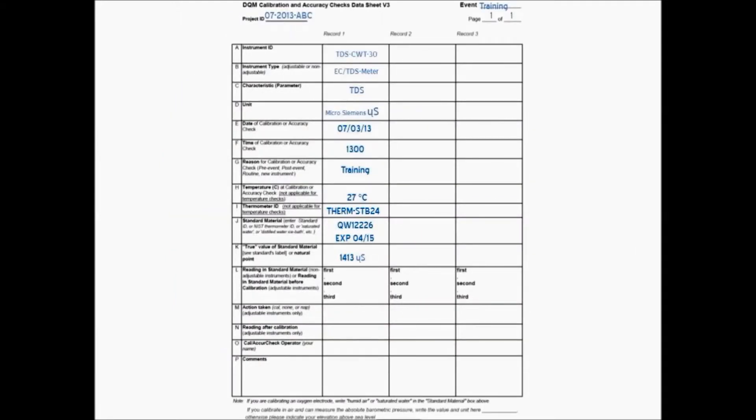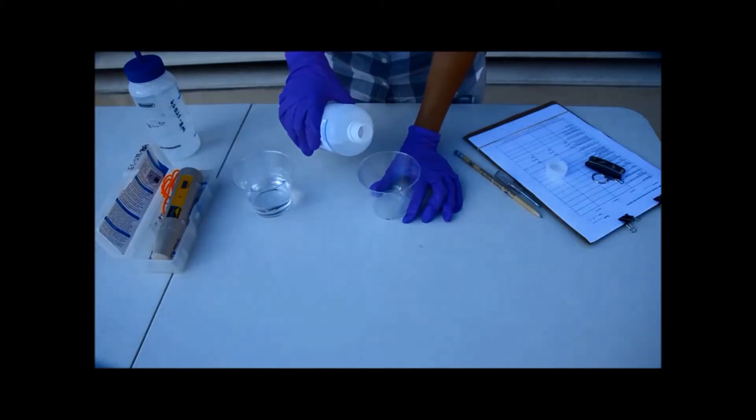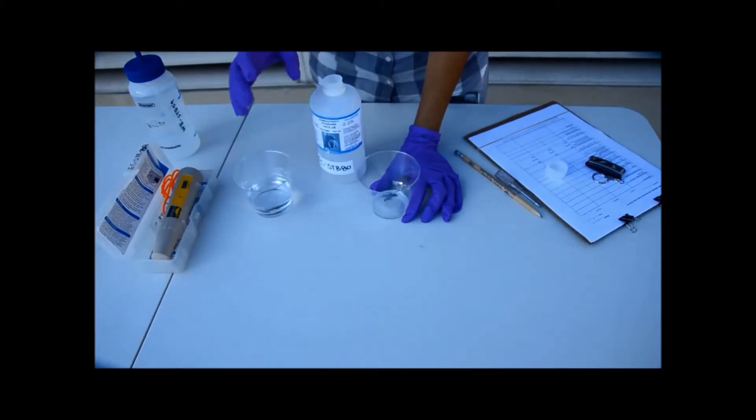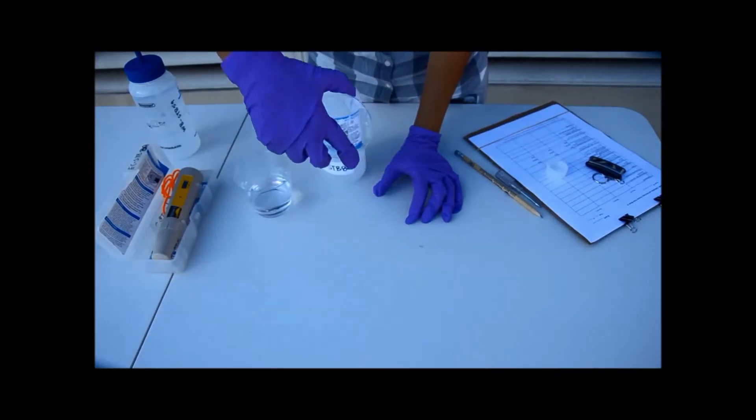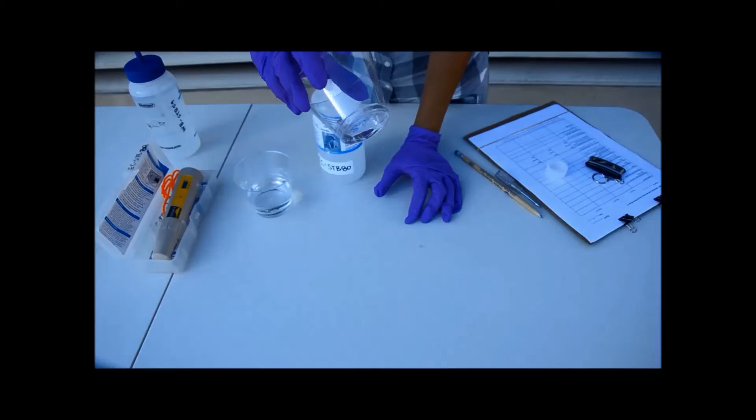Begin by pouring calibration solution into a clean cup. Prepare the cup by pouring some calibration solution into it and swirling it around. Then decant this into your waste container.